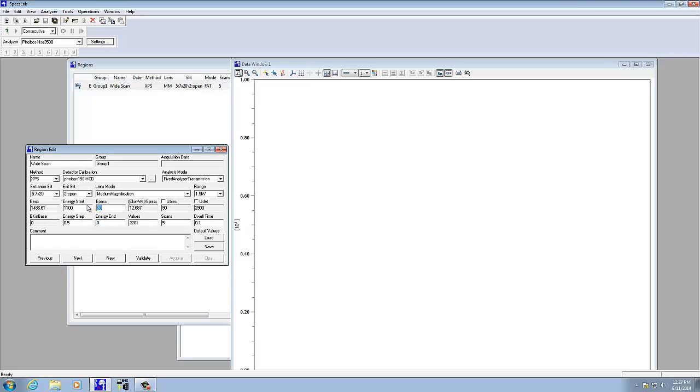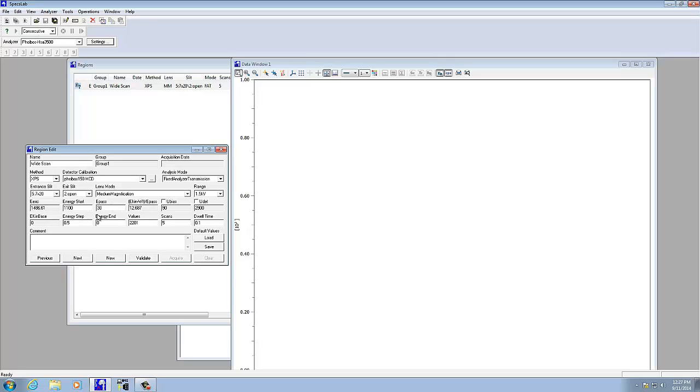Pass energy is basically a tradeoff between number of counts, number of electrons that arrive per second, and the energy resolution of your scan. In this case I'm doing a wide scan, so 30 or 40 EV pass energy is fine. If instead I was doing a high-resolution scan, I would probably make that 10 EV. The energy step basically tells how to increment the energy on the analyzer. I'm going to set that to 1 EV.